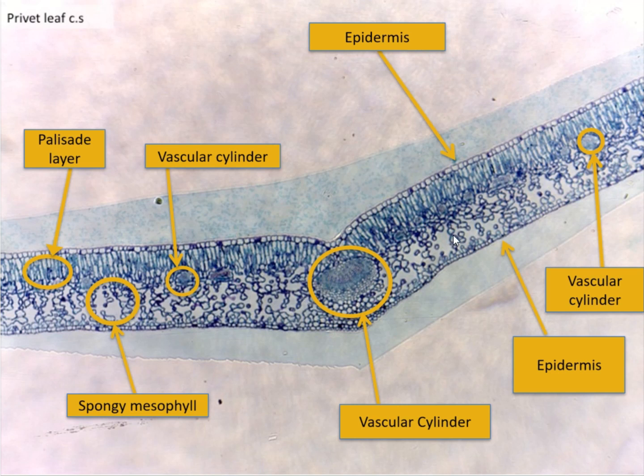Next, we have this spongy mesophyll layer. This is going to be underneath the plant, so it's not going to actually get direct sunlight, but again, leaves do participate in photosynthesis, so it must have some other photosynthetic function. In this case, it's the region of cells that allow for the exchange of carbon dioxide. If you'll recall, carbon dioxide is one of the necessary reactants that has to be present in a plant in order to carry out photosynthesis. It's this spongy mesophyll layer that's going to allow for carbon fixation, or the entering of carbon into the plant.